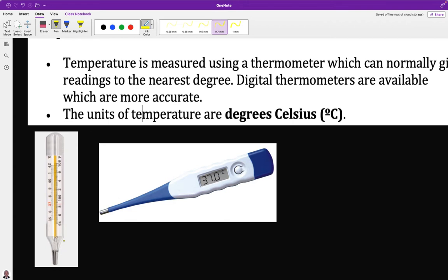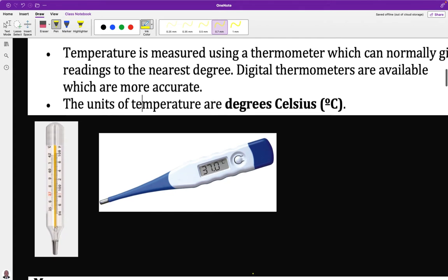Reading the thermometer is very, very important — you need to know how to read the mercury level. As we proceed I will show you how to read it. Remember, the units of temperature are degrees Celsius.